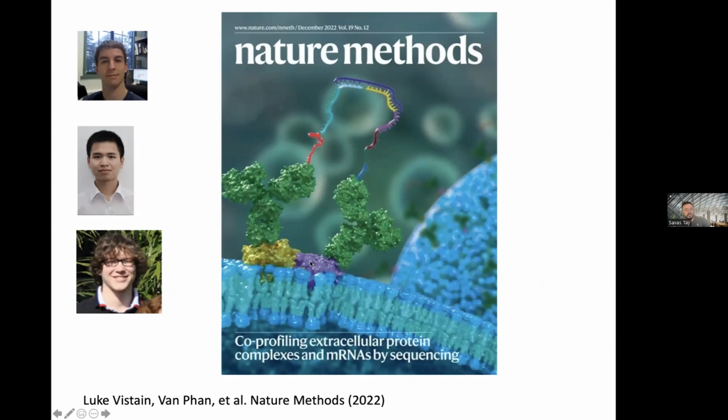This is one protein, another one in purple. And we have two antibodies binding to each protein. And then we have these oligos specially designed. There's a region where, with a connecting oligo, you can create double-strand DNA, and then synthesize this, amplify this, and then run this through next-generation sequencing, like Illumina sequencing, to get information about protein complex formation, okay?